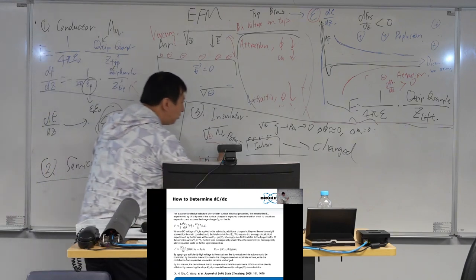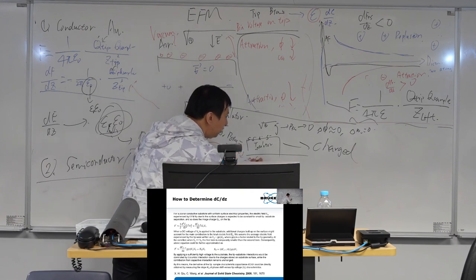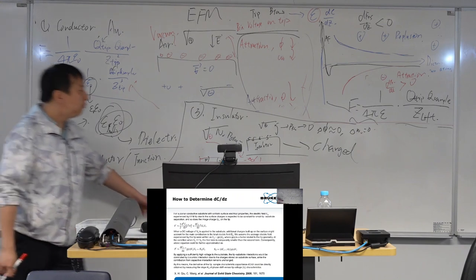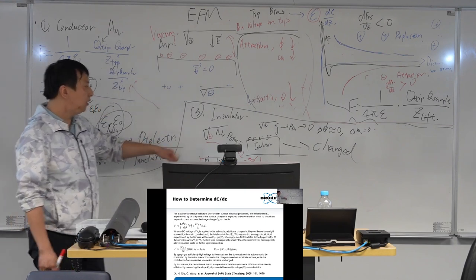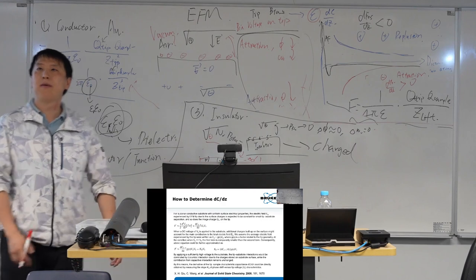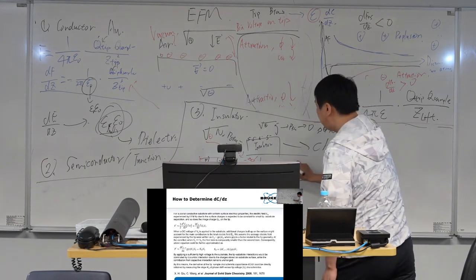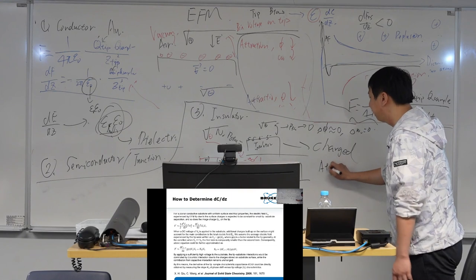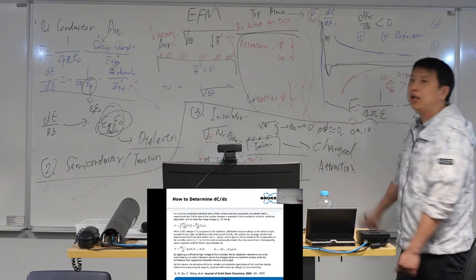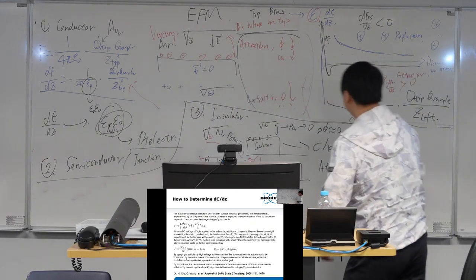And again, it gives you the delta omega reduce, delta phi reduce, something like that. So if I detect the phase shift or resonance frequency shift, it reduced, it tells me I'm on top of positive charge. Of course, if my sample is negative charge, it's the same story, right? It's the same story because I always detect the attraction. I always detect the attraction force. So in the EFM, I would summarize in this way.